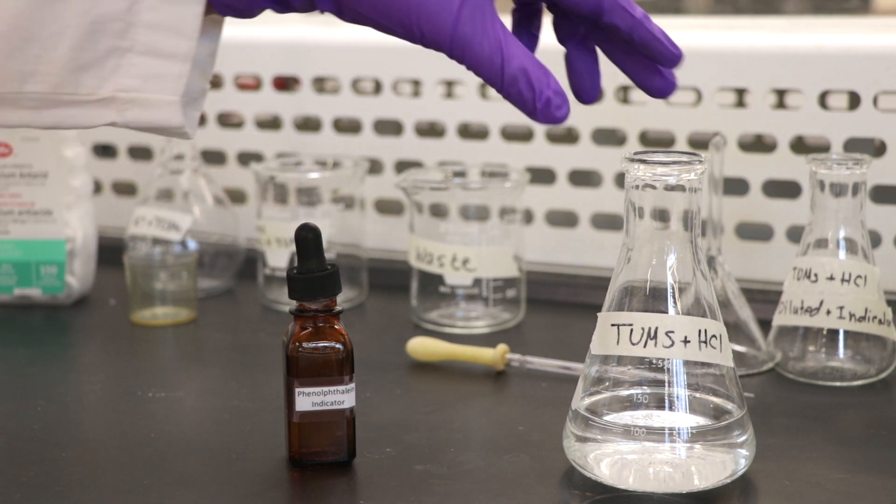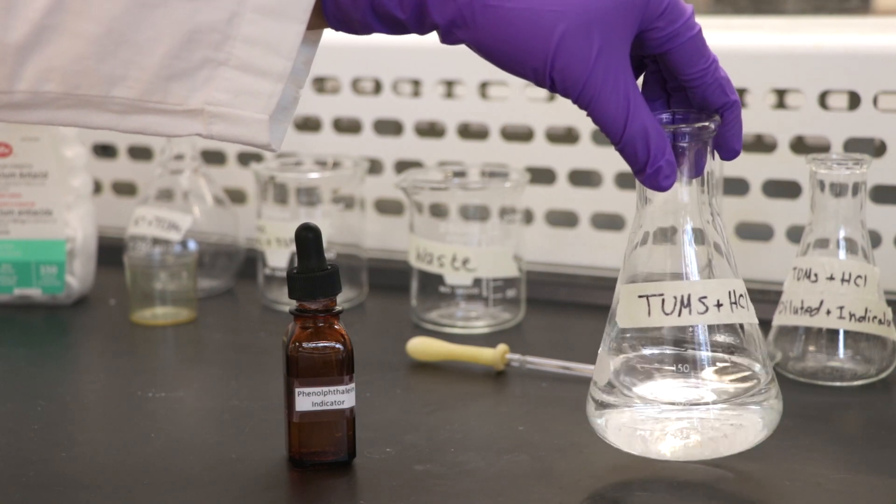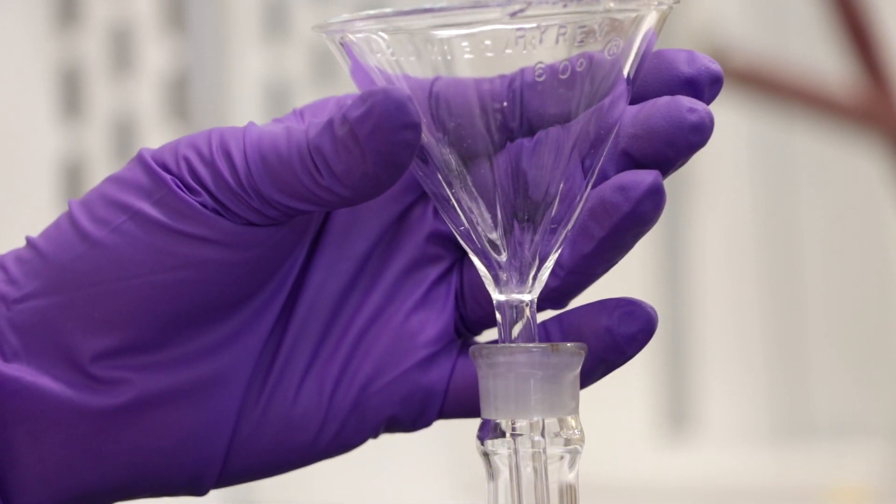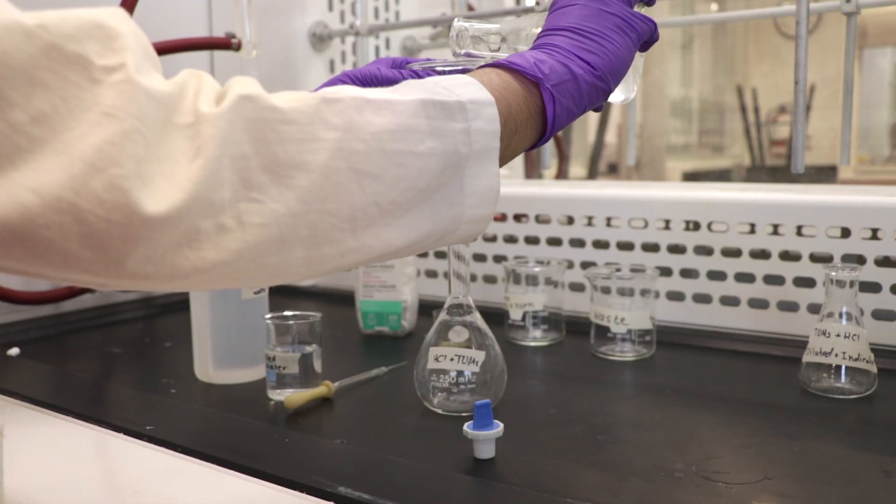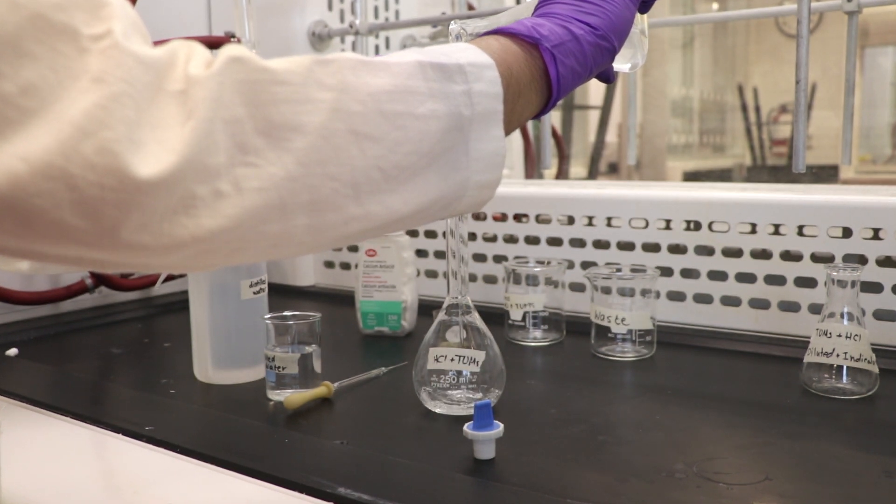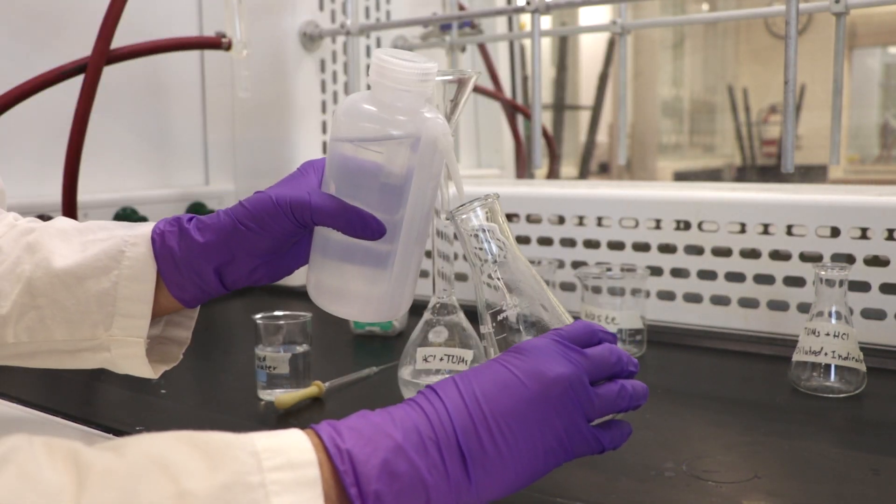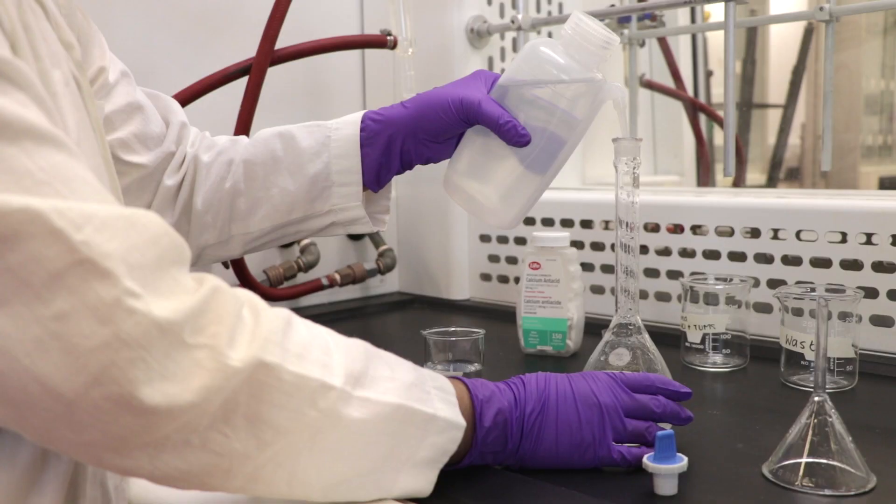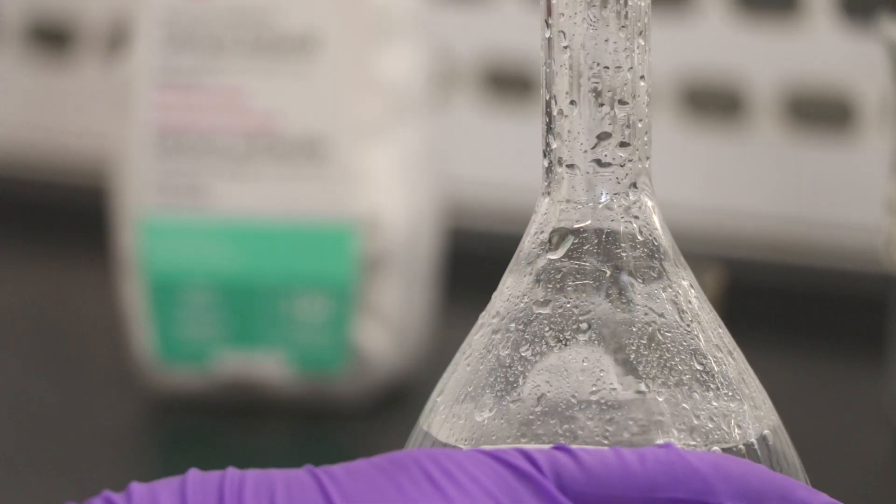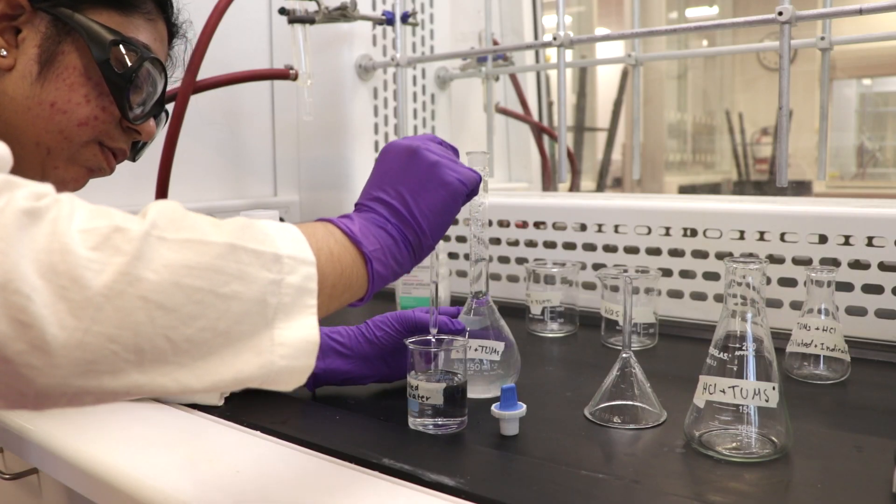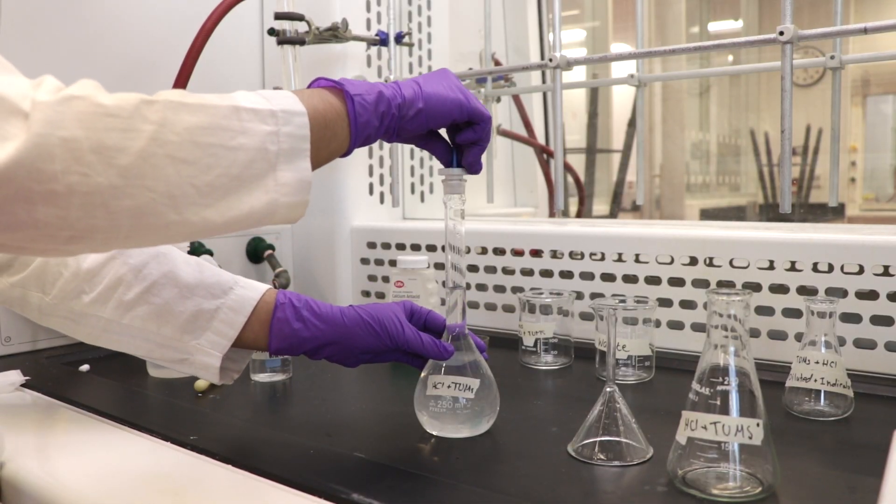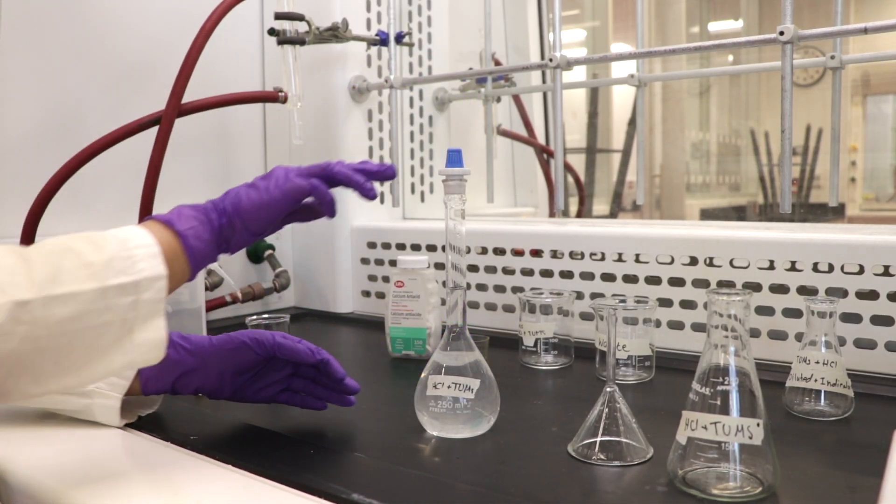Transfer the solution to a 250 milliliter volumetric flask. Make sure the funnel is lifted when you pour. Rinse the Erlenmeyer flask and the funnel with distilled water. Dilute the solution to the mark with distilled water. You may want to use a disposable pipette to make the bottom of the meniscus meet the mark. Place the stopper and twist. Invert the solution to mix.